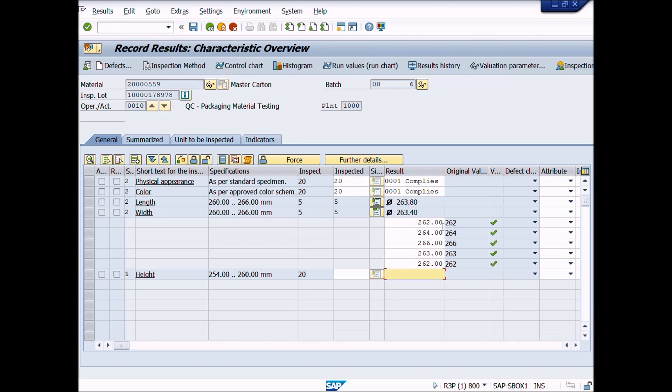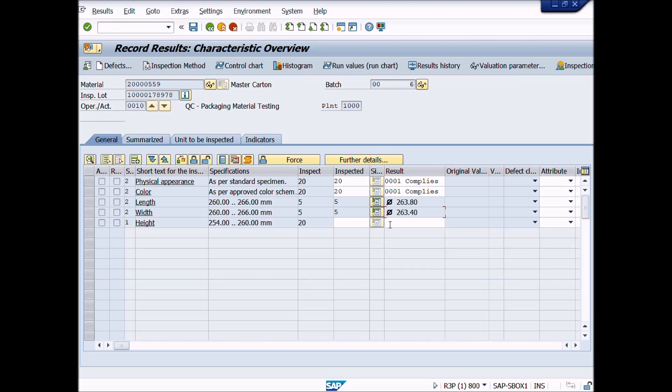You notice that plus sign of height inspection characteristic is disabled. This is because we have set the criteria in control indicators as summarized recording. That's why we can enter one value or average value for this test, like this. Then press enter from your keyboard.